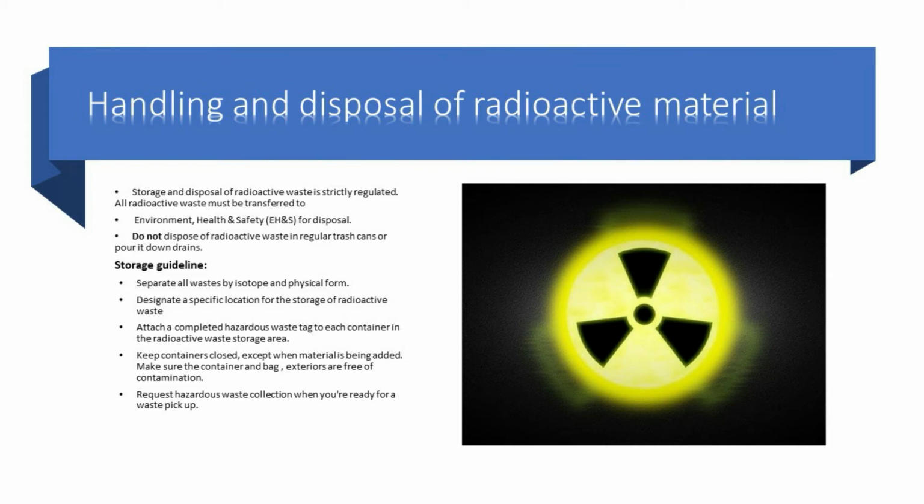Storage guideline. Separate all waste by isotope and physical forms. Designate a specific location for the storage of radioactive waste. Attach and complete a hazardous waste tag to each container in the radioactive waste storage area.